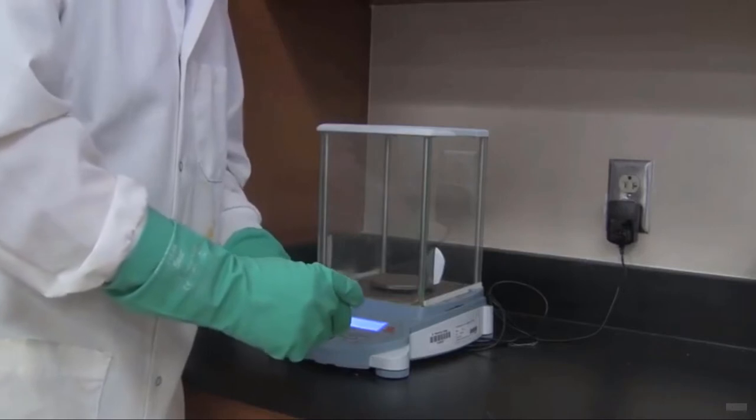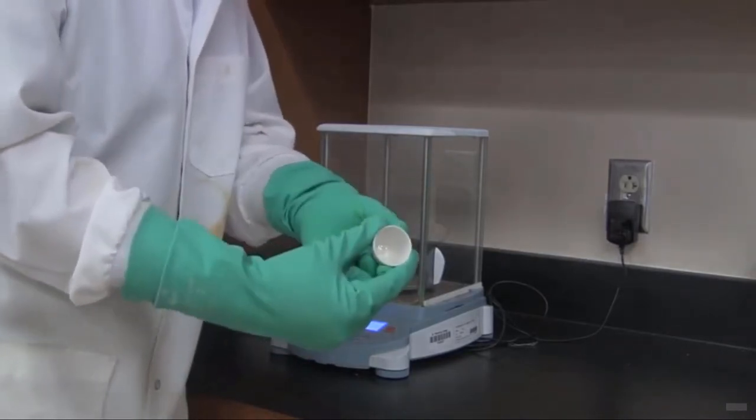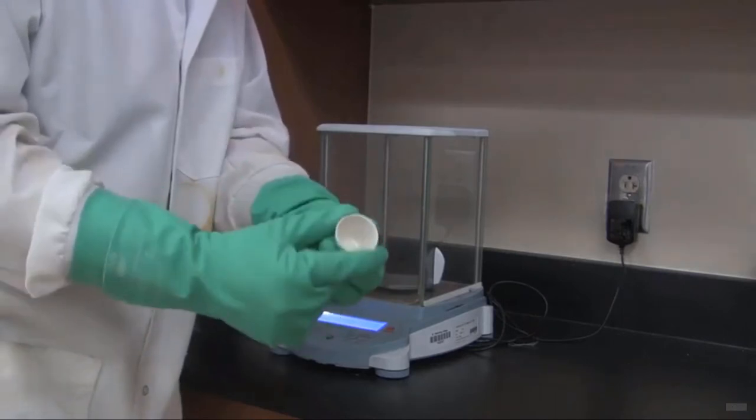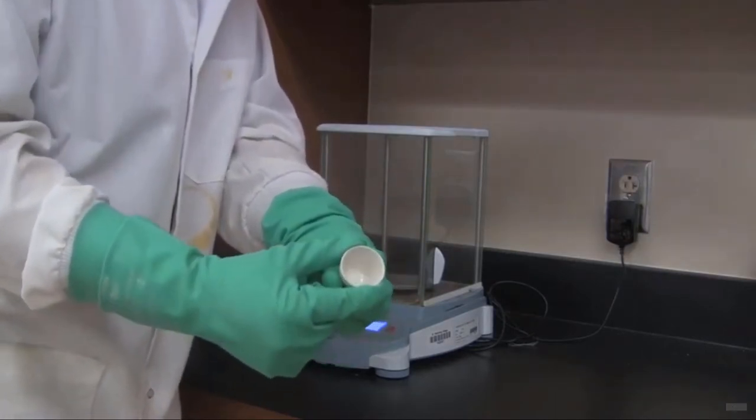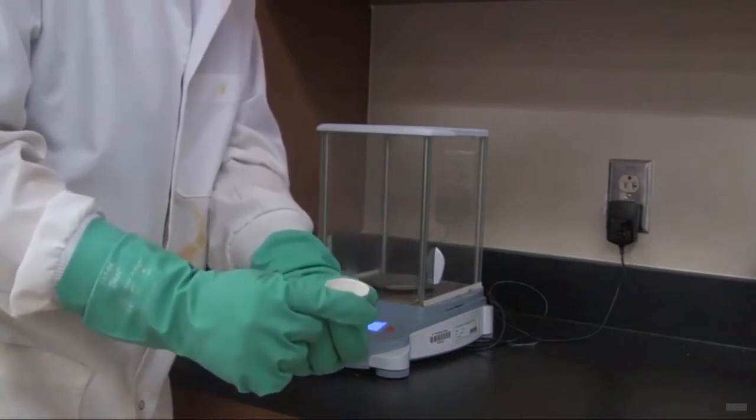This is the first part of the empirical formula lab. What we're doing is we're getting a crucible, and this crucible is in good shape. There's no holes or anything in the bottom of it. And what I'm going to do first is weigh this crucible empty. Notice I'm going to weigh it without the lid.